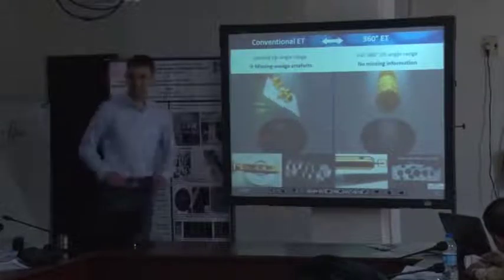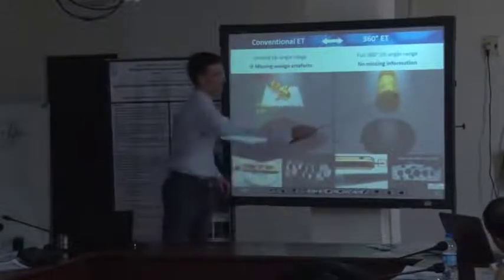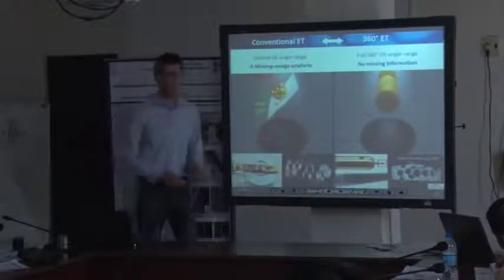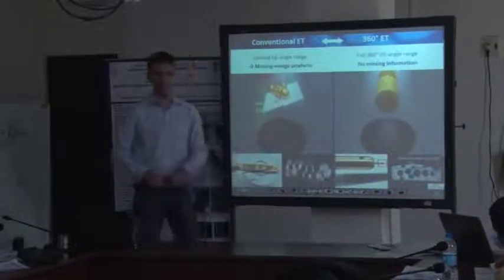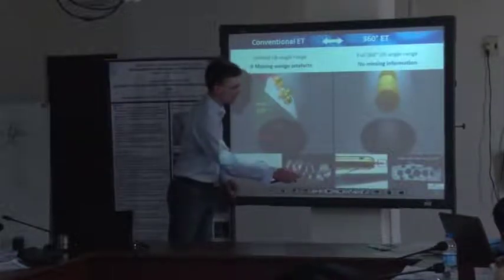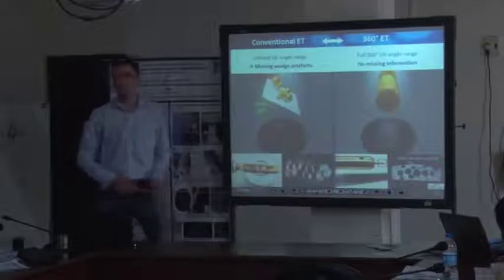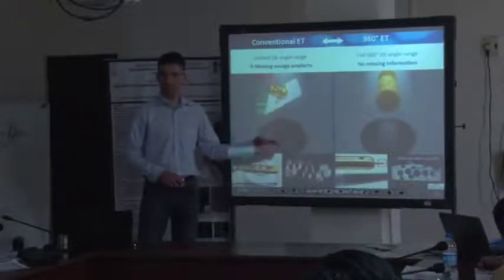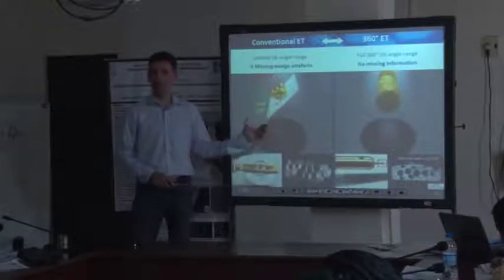Another way to record tilt series is to prepare a pillar of our material, or to deposit nanoparticles at the very end tip of such a so-called sample holder here. And there are sample holders available that allow for the rotation of the TEM sample by, let's say, 180 or 360 degrees.